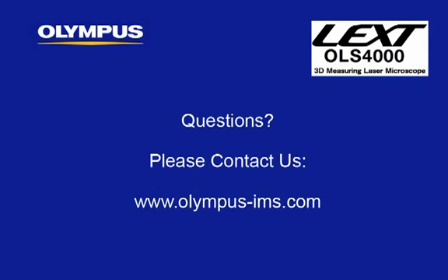In this instructional video, we have covered panoramic image acquisition with the Olympus LEXT OLS4000 3D measuring laser microscope.